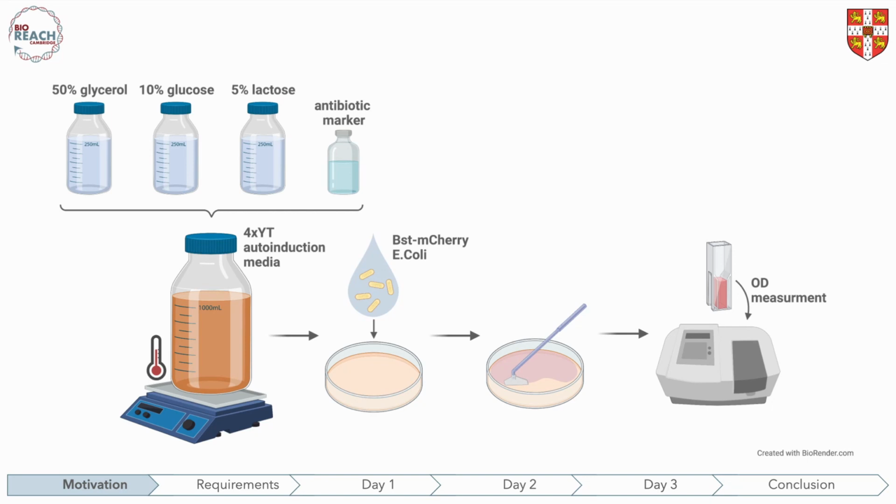By optimizing the ratio of glucose and lactose in the agar medium, we can combine the bacterial replication stage and the induced expression stage in one step. Sufficient glucose allows the bacteria to grow to the optimal cell density before the glucose is exhausted and lactose must be metabolized, inducing protein expression. The biomass can then be easily collected by scraping the agar plates and the desired protein can be extracted.